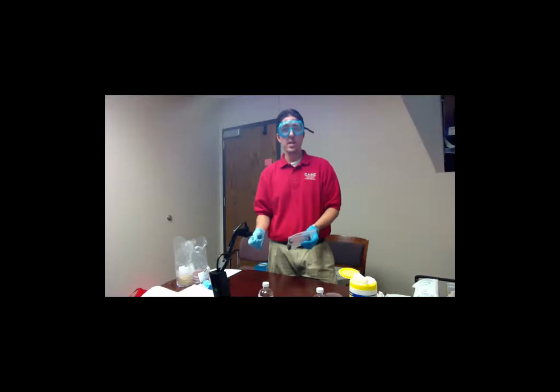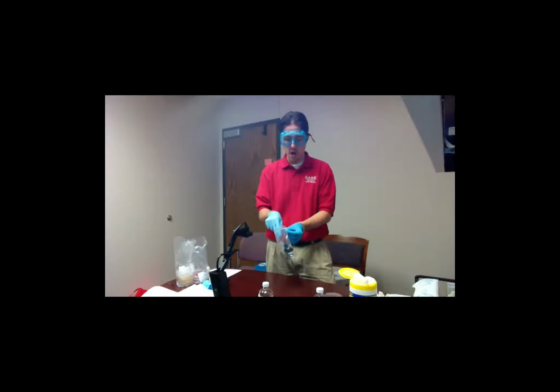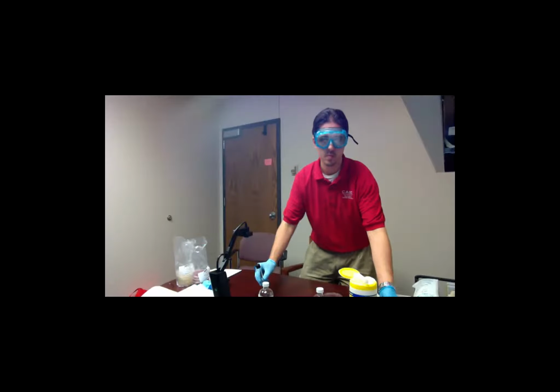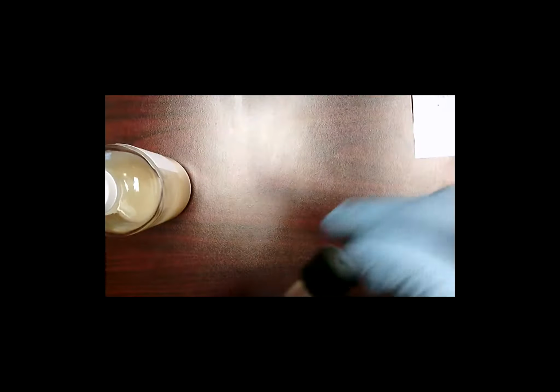But the thing you want to be cautious of is Carolina recommends that the water doesn't stay in the test tube for more than 16 hours. So you want to get it fairly close to when you're actually going to plate the water on in the Petri dish. So the kit comes with sterile tubes, which Matt's going to show us here. So the little plastic test tubes are sterile. Once you unscrew the black lid, you risk contamination.